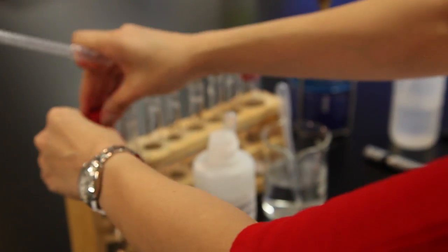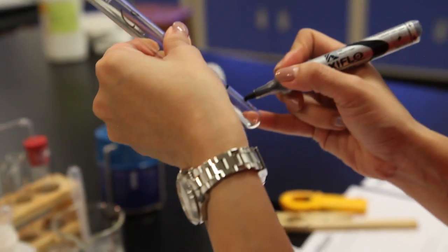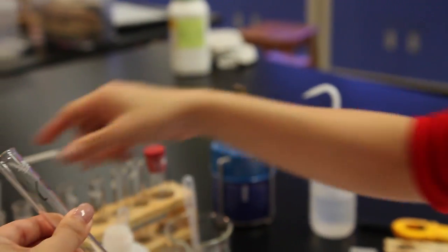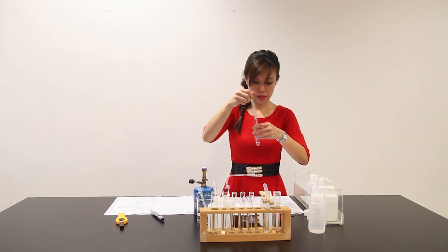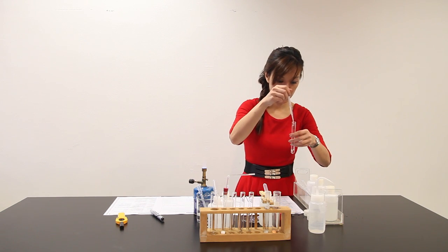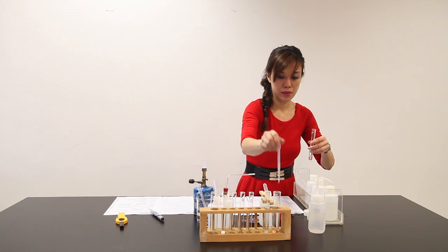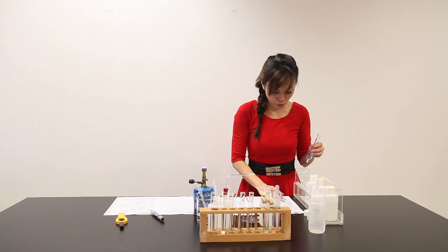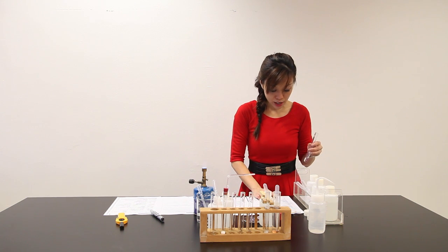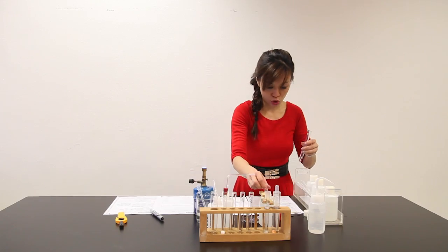Let me put this here. It says place about 2 cm³ of Q into a clean test tube. This is Q. I'm supposed to put 2 cm³ of Q into this test tube. And then it says add a few drops of sodium hydroxide, shaking the test tube between each drop.